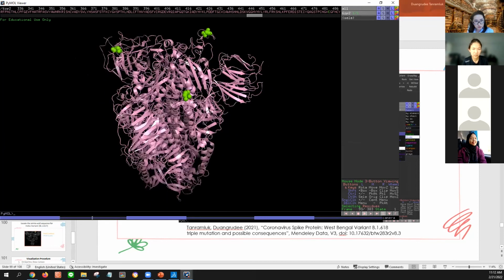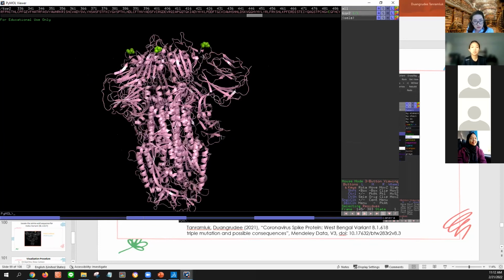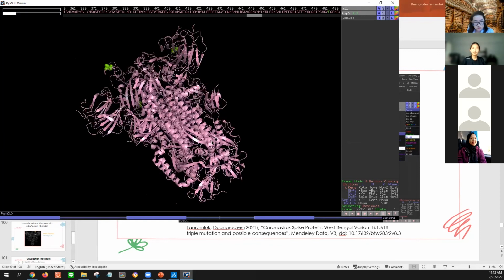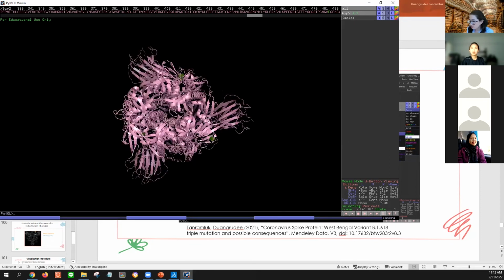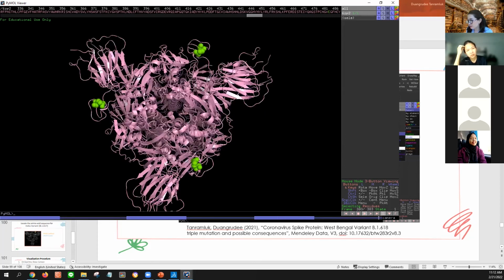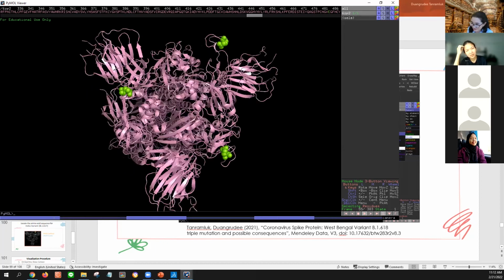I don't mind. You just try to make the spike protein. It's not important that you need to do B.1.618. You can attempt other spike proteins, but the Omicron one has like 30 positions and 3 chains, so it's 90 residues. That's too much.